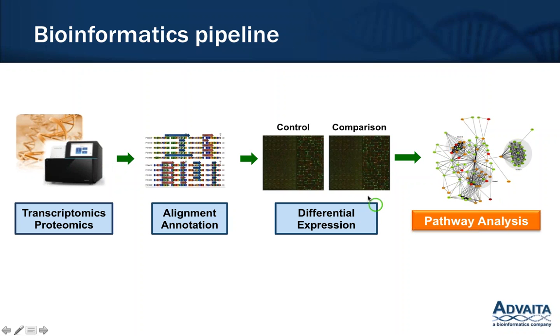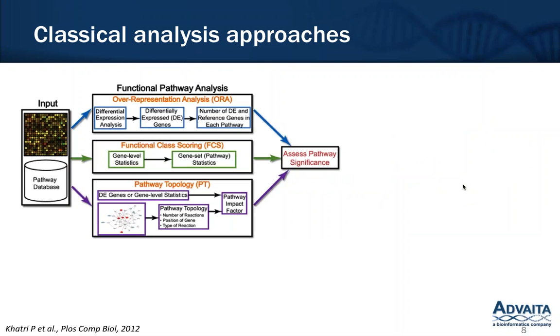We do a little bit of differential expression analysis on microarray files, but predominantly we take the differential expression data as input, and we provide you that pathway analysis. We also have a quaternary type of analysis where you can compare multiple pathway analyses against one another and elucidate what are the key drivers between those different experiments.